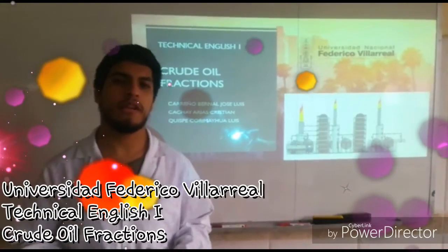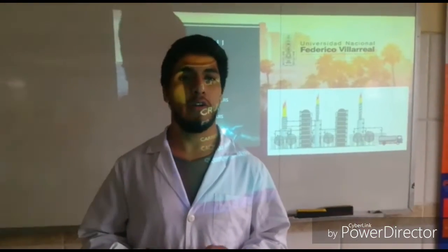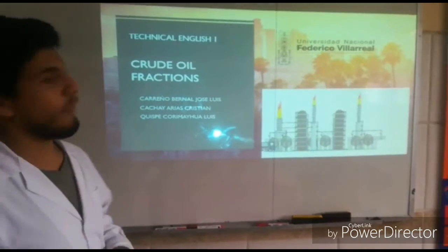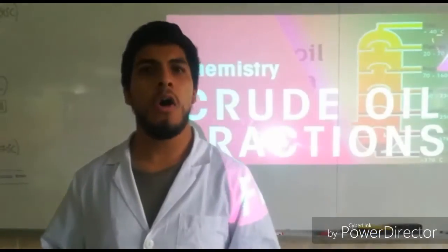Hi, today we are in the experimental laboratory of chemistry at Federico Villarreal National University. We are going to talk about crude oil fractions. But what is the first question? How can oil be separated into different fractions?